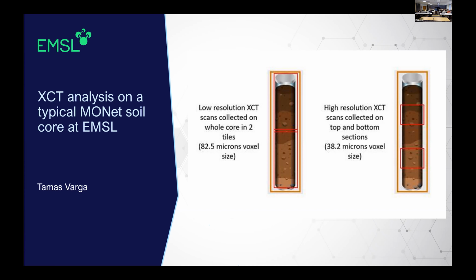So even, let's say, 10-20 degrees of temperature fluctuation can result in large enough changes. In micro CT, you just see a blurring of the features. But we are working on a way to scan cores with cooling.